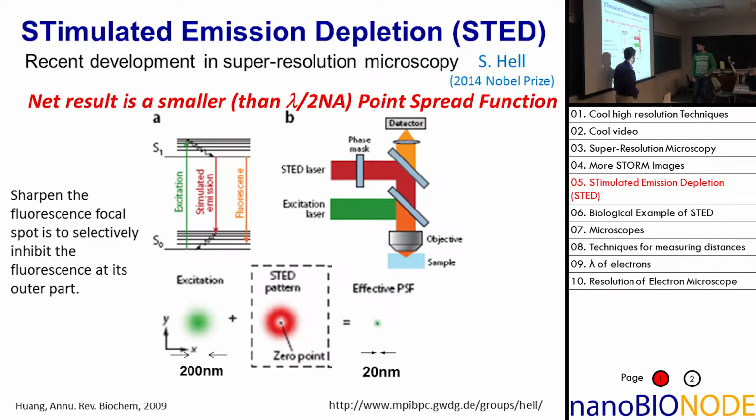And so together, the only thing that is really fluorescing is right here in the center. And molecules that are exposed to this light, because it's such a strong light, it comes back down. It lasers actually at that same wavelength.